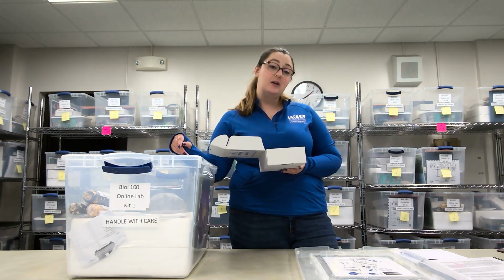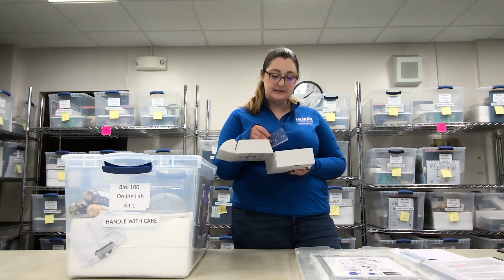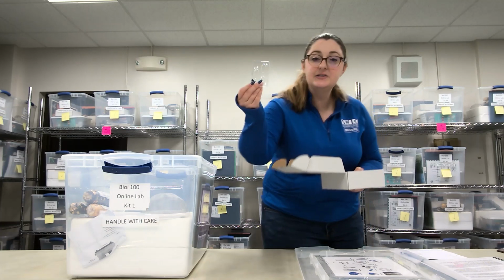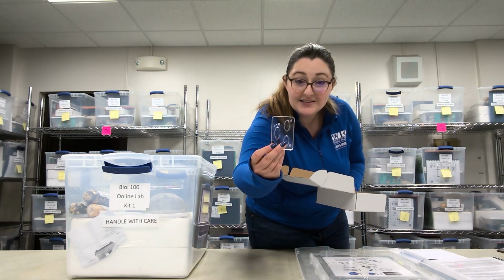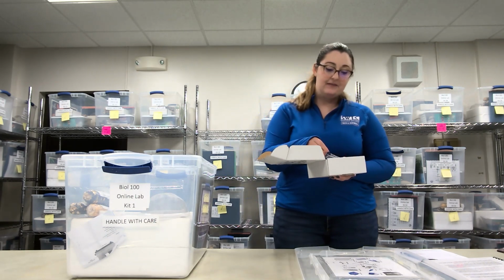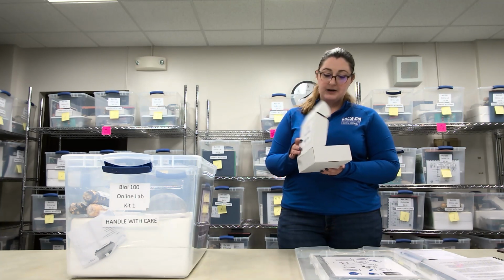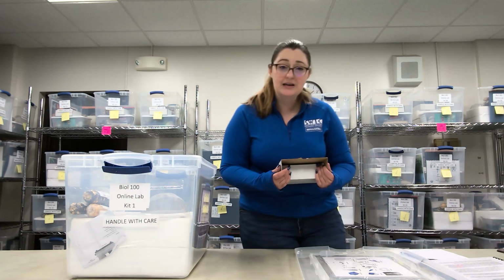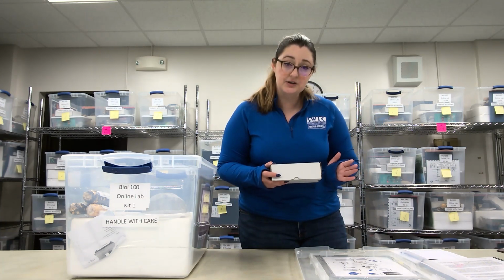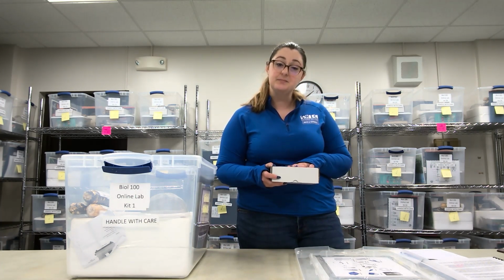You should also have a handful of toothpicks. Make sure you have a handful of toothpicks, as well as at least 4 of these. They are the blood well plates. So make sure you have at least 4 of those. I would also recommend not consuming any of those items and making sure that the blood well plates are nice and clean before they go back into this box.